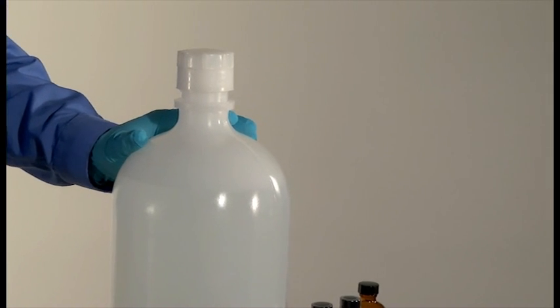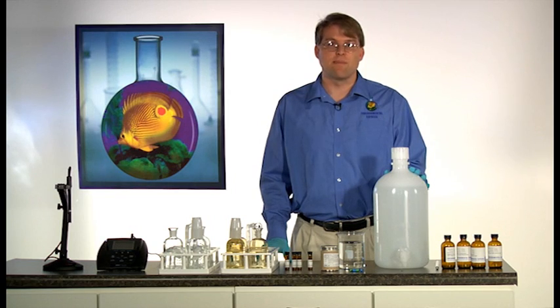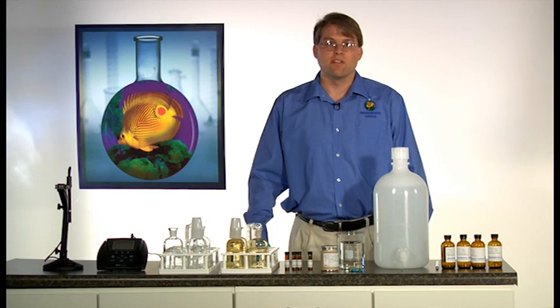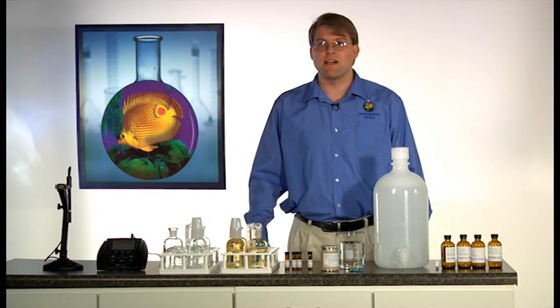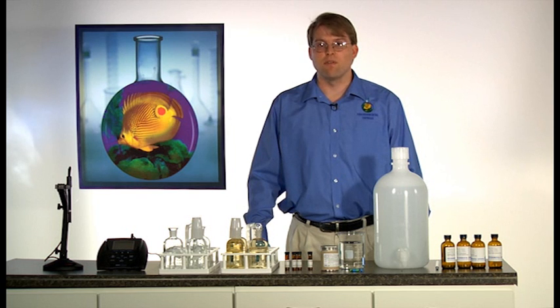Obtaining acceptable dilution water is the first step in doing an acceptable BOD batch. The quality of the dilution water is important because this water will come into contact with every sample involved in your batch.